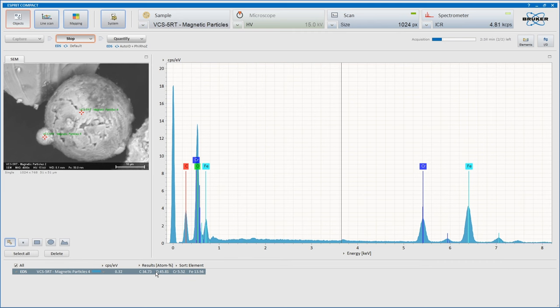Now, we saw chromium also in the crenellated spheres on the inside in the thunderstorm generator, the 24-inch sphere. And that is assumed to be because of the capture of chromium from the base steel. But maybe it's actually 4 carbon atoms fusing. Maybe.